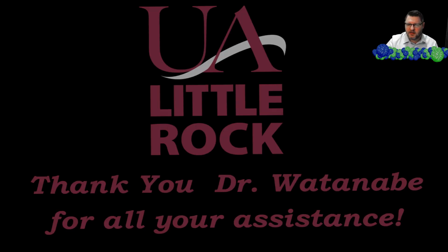Okay, that right there is it. If you have any questions, please let me know. If not, hopefully we can use the EDS whenever it comes up, and we'll be able to evaluate this sample a little bit more in detail.